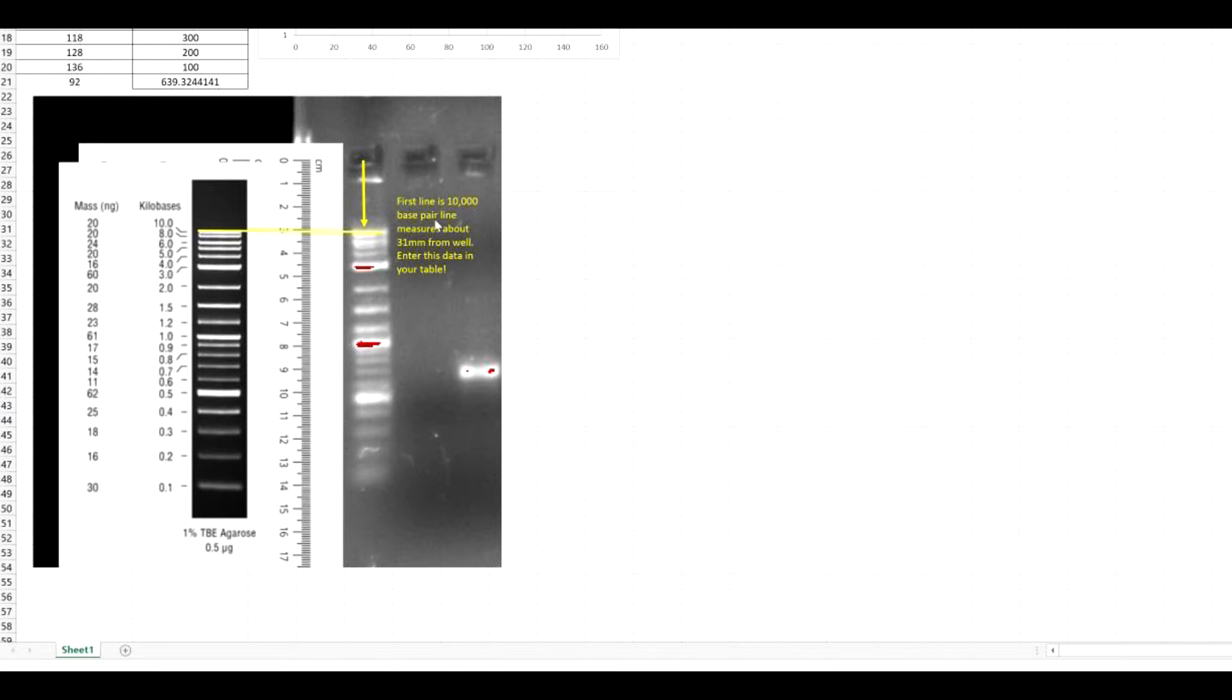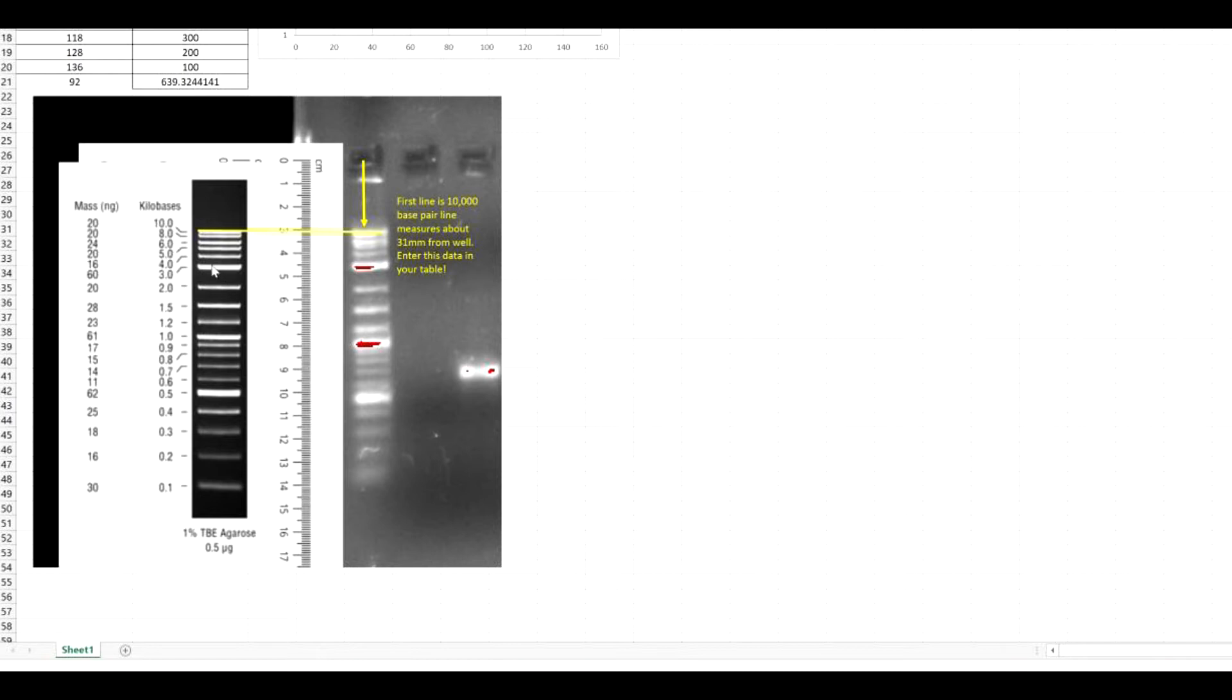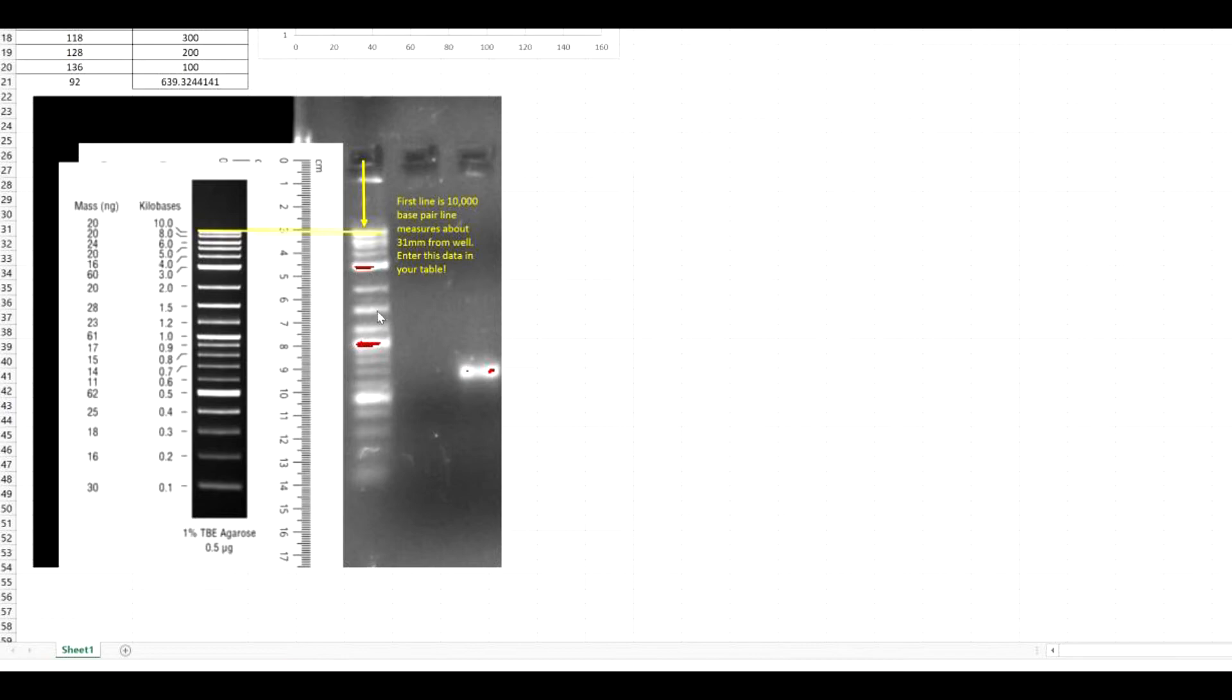And so on and so forth. If you're having trouble recognizing these bands, there's bands that will always show up really bright. So that one that would be the 10,000 base pair band, which is your first band. The 3,000 base pair band, which would be the band here. And then you can look at the 1,000 band, which is here. And then the 500 band, which is here. Those 4 bands are usually the brightest. And then you can try to discern what the sizes in between these are.